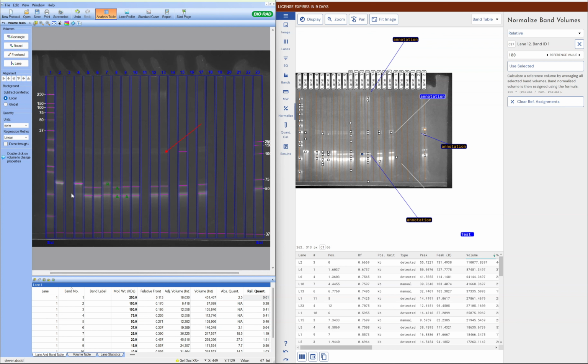I'm honestly not sure what the volume tool is meant to be. Is this right? So this is the ability to define an area and measure the volume. So this is more of a toolbox function, really.